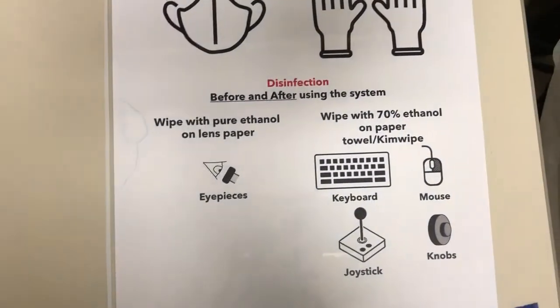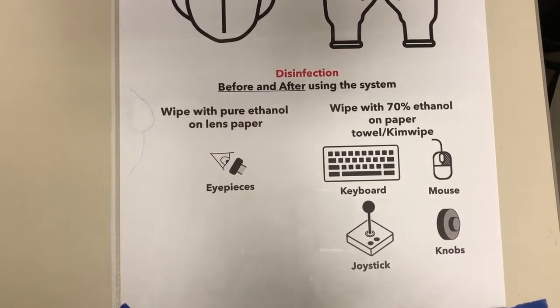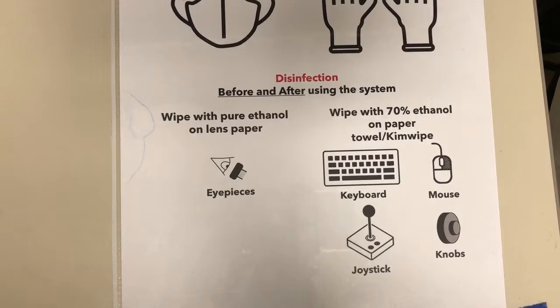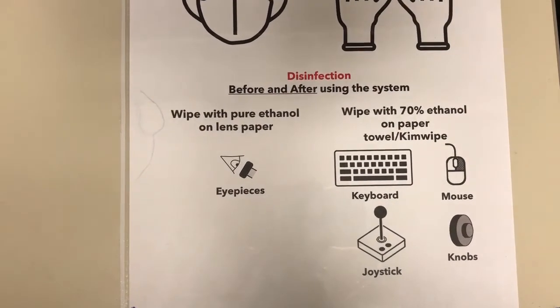The next step is to disinfect the system. We'll need to do this before and after we use it. Before, we will need to wipe with pure ethanol on lens paper the eyepieces, and then wipe with 70% ethanol on a paper towel or kimwipe the keyboard, mouse, joystick, and knobs.